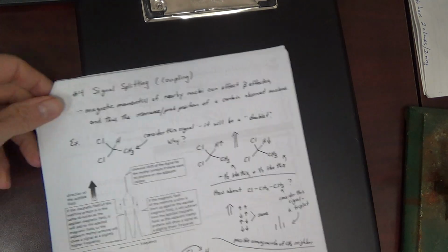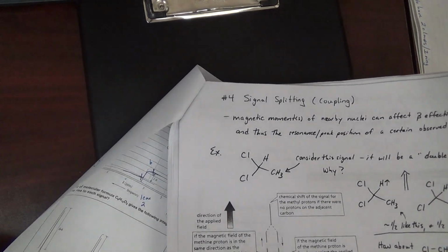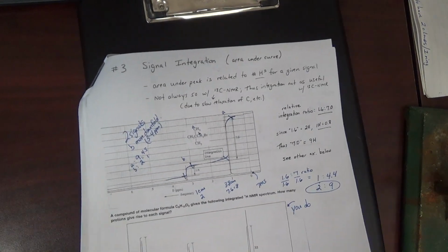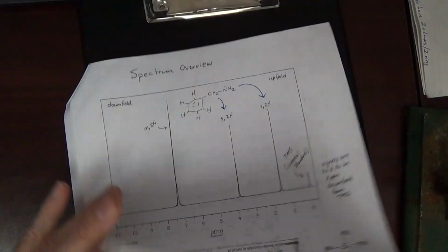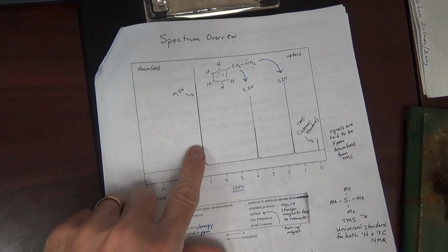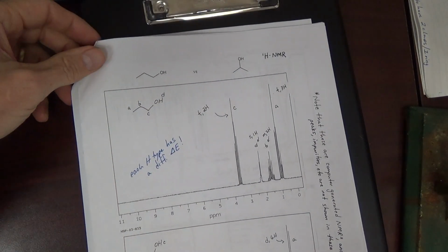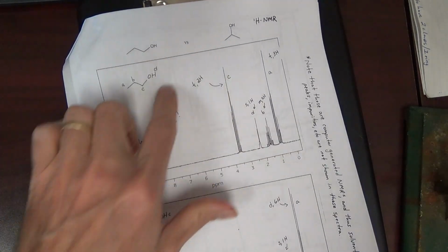Okay, signal splitting, topic number 4. Of course, when we look at an NMR, but not that one, both signals are singlets in that NMR. But if we back up a bit, typically you're going to find, well, again, singlets here. That's a multiplet, but it's sort of all on top of each other. To go back to some very clear splitting, go back to the two NMRs early on of the two alcohols.